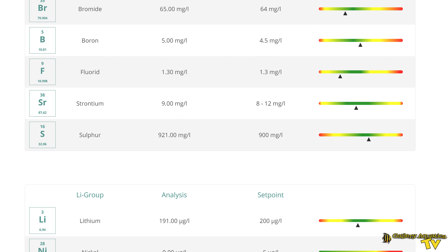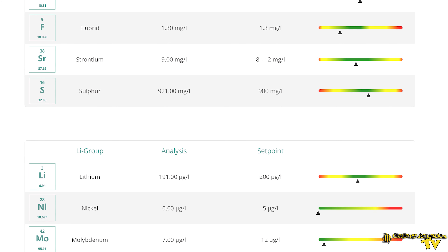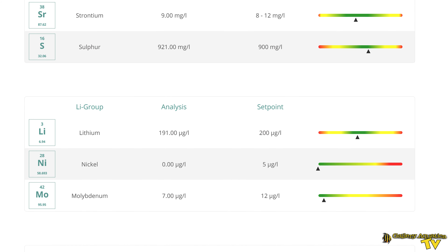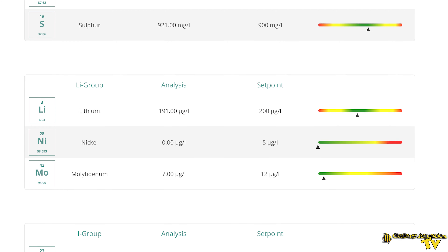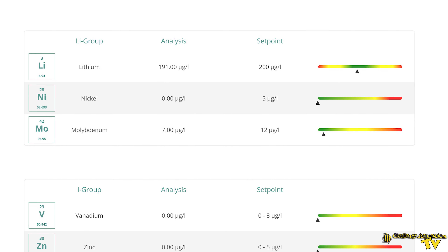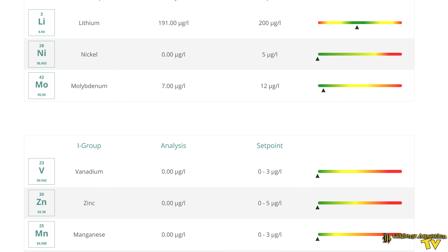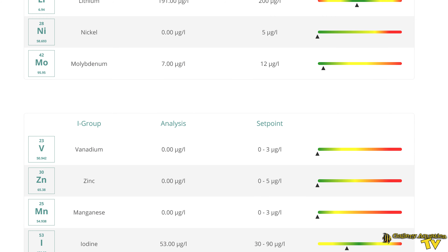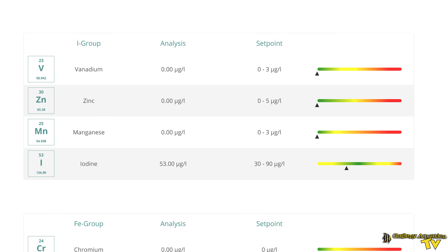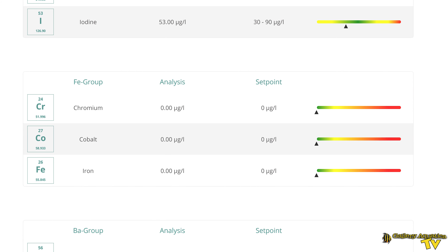We've got some other readings which are all within the green. Strontium is particularly important — we've got nine milligrams per litre. Nickel, another one that can contaminate your aquarium water, is coming in at zero. Zinc and manganese are also all within the green, so our natural seawater is looking really good. Chromium, cobalt, iron — all in the green. Exactly what we want to see.